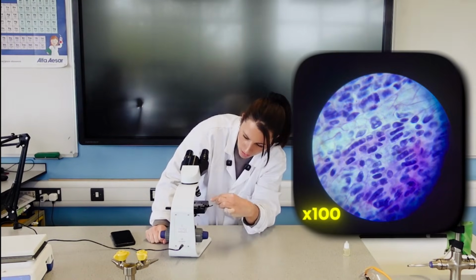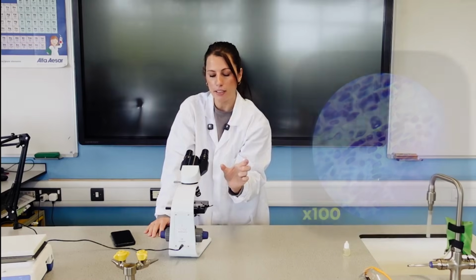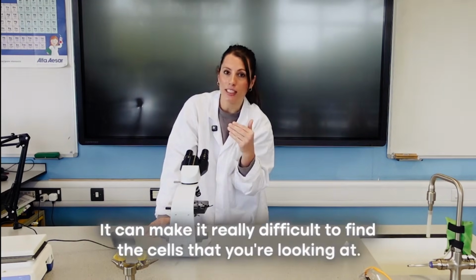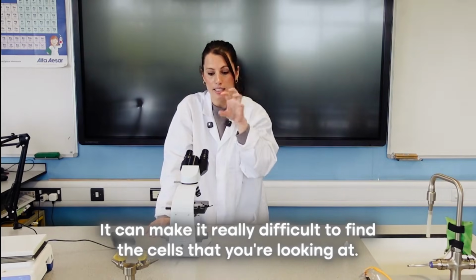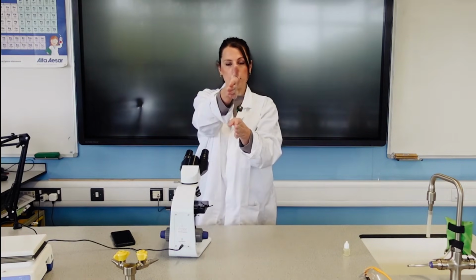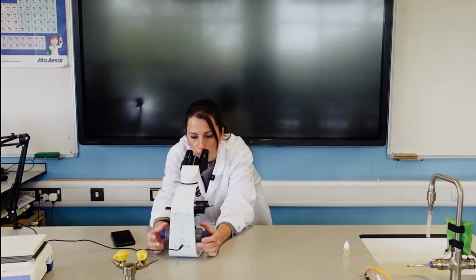So what I was just doing then was, because I took the slide out to put the oil on, when I put it back, it must have been at a slightly different position. And when you're at that high magnification, it can make it really difficult to find the cells that you were looking at. So what I then did was just moved it all the way out to make sure I definitely had it aligned in the correct position in this way. So let's call that vertically. So when I moved it backwards, I could see when it went exactly underneath the lens and it would be in the correct position. And now I have managed to find it without having to go all the way back up to the lower magnifications.